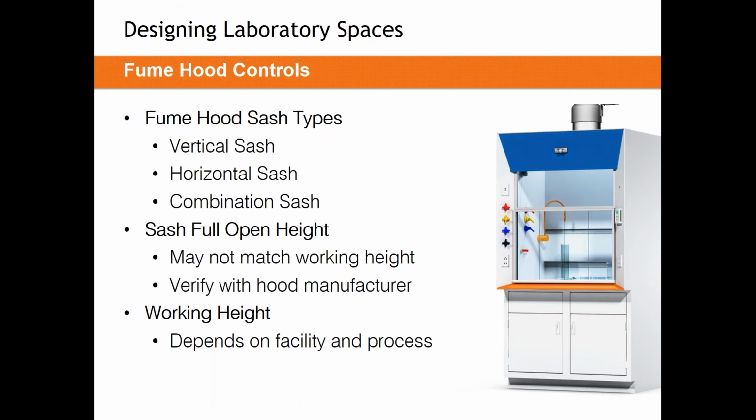The next position these can be in is the full open position. This is often not a normal operating condition. Some fume hoods will never go to their full open position. So on the hood we're showing on the screen here, those can open to 24 or 30 inches when they're wide open. This is sometimes used for setup of experiments, but oftentimes the mechanical system isn't designed to actually accommodate that full open position, that wide open spot.